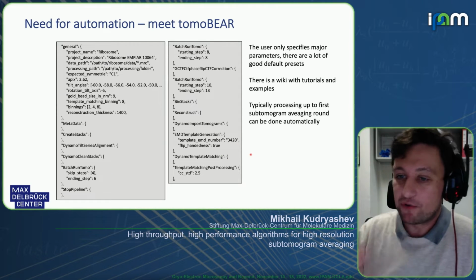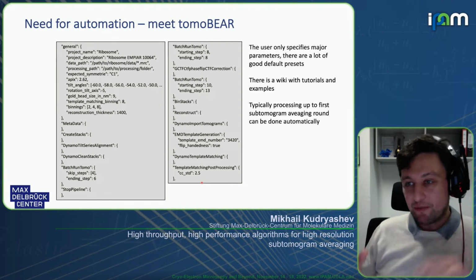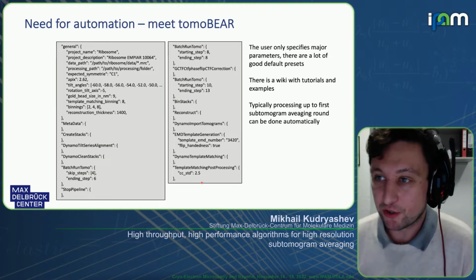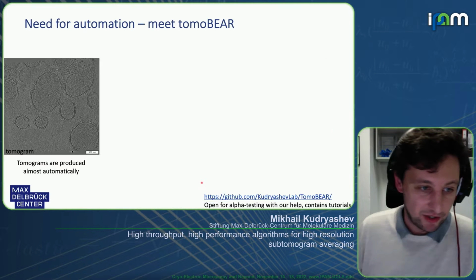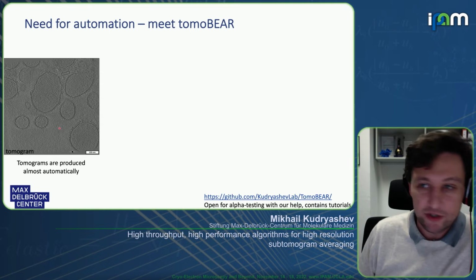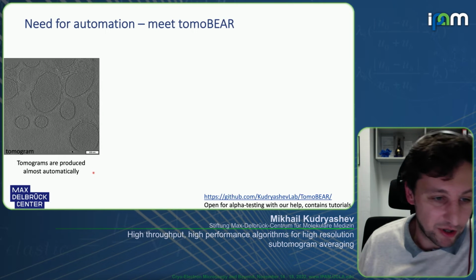So basically, the steps up to here would give you the results of the template matching. You would have your particles, and the particles will have the initial orientations. This is a little illustration. It's again the ryanodine receptor. It's a slice through a tomogram, without any pre-processing, so that you can see how noisy it is, but it's actually a nice tomogram.